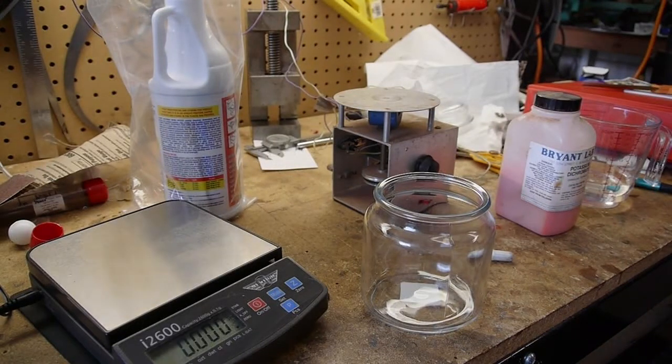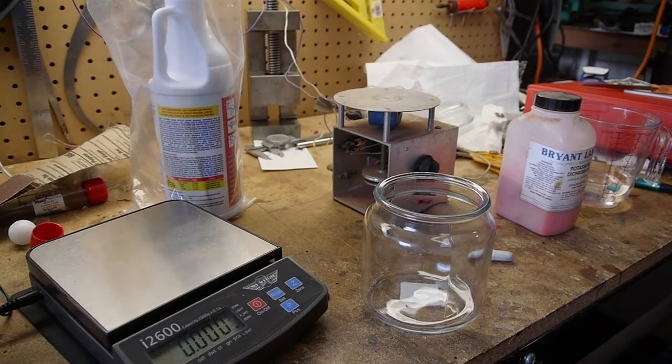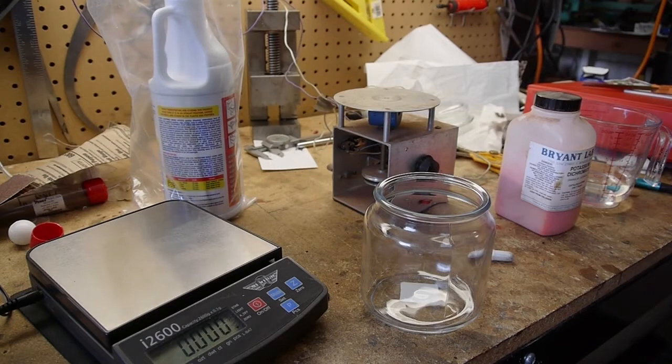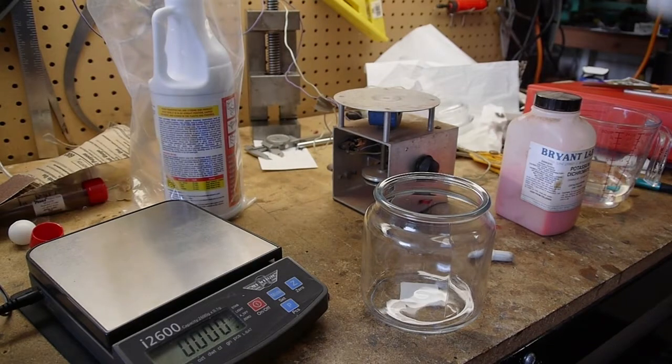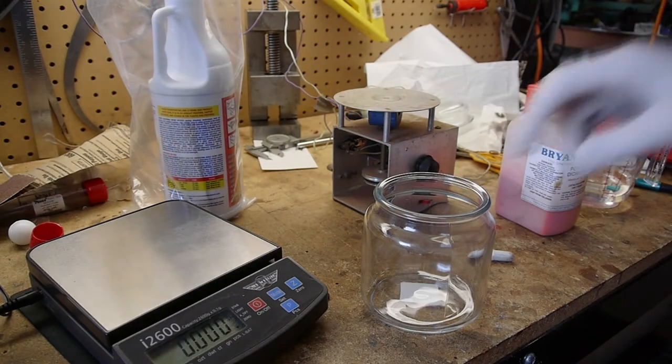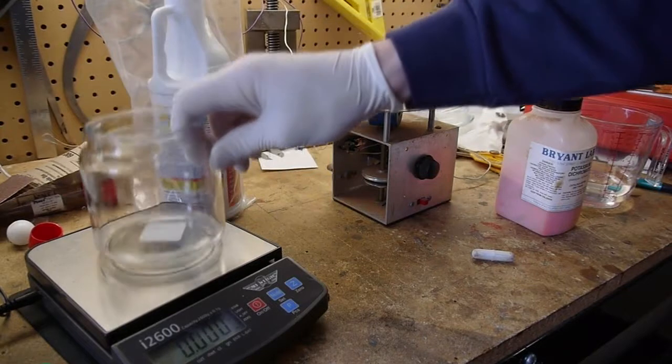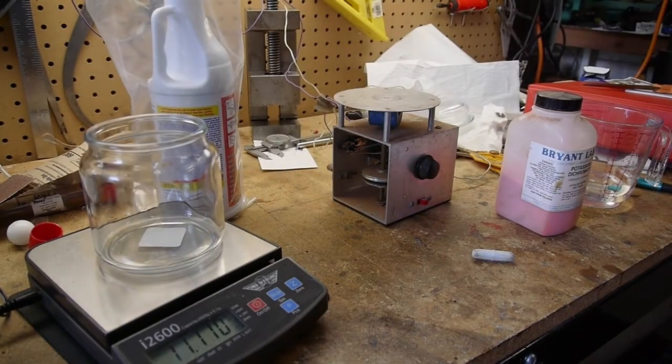Okay, so today I'm going to be making a solution that will etch Delrin plastic, acetal plastic, so that it can be glued or maybe painted or coated with something. The Delrin by itself is so slippery that coatings won't really stick to it. So I'm going to start off here, and I found this formula for an etchant which is sulfuric acid based on the net, and I'll post a link.